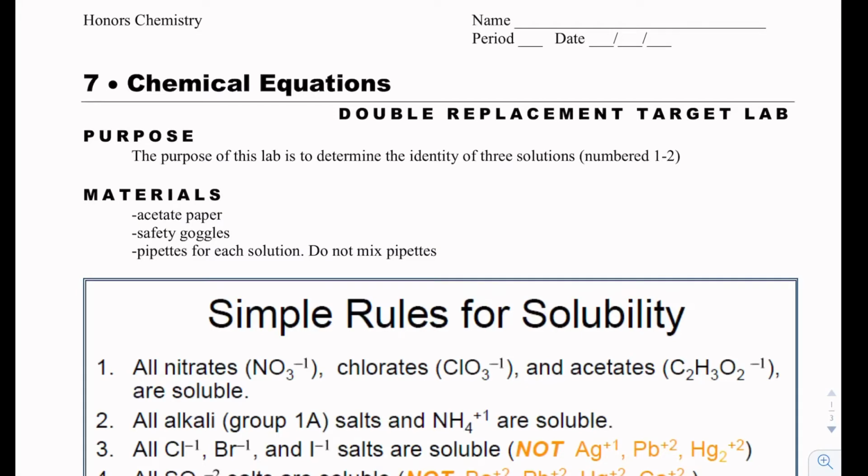In this video, we're going to go over how to perform a mystery solutions lab. This one specifically deals with double replacement reactions, but you can use the principles of this example to do single replacement as well.